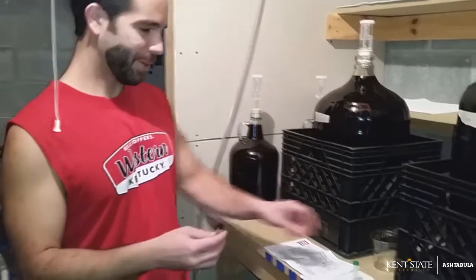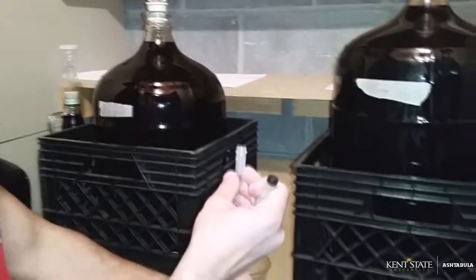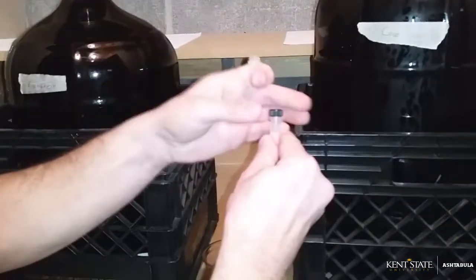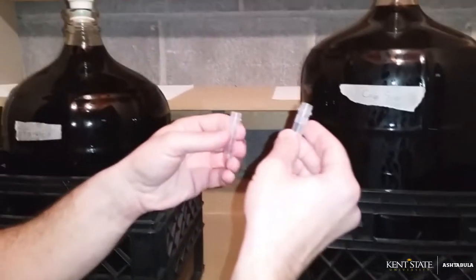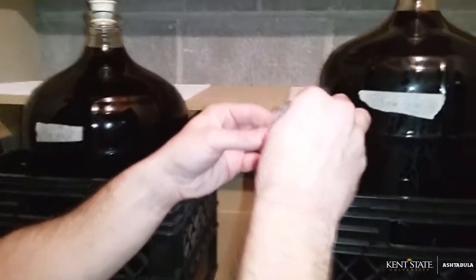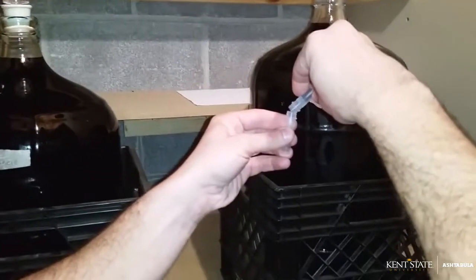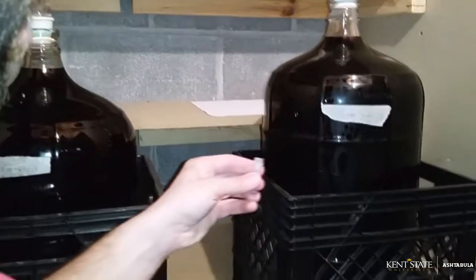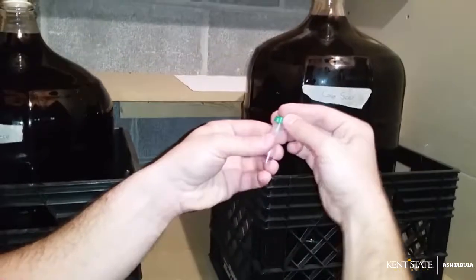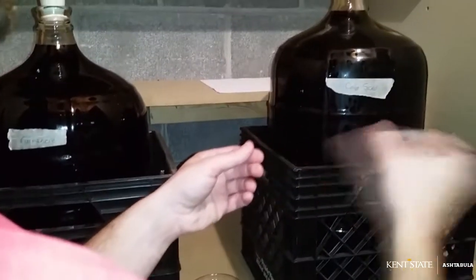So what I have here first is a tube with a green cap, and I'm following the directions of pouring in the liquid solution in the black cap tube, transferring that over. And as directed, putting the green cap back on, and I'm going to shake it for about 1 minute before moving on.